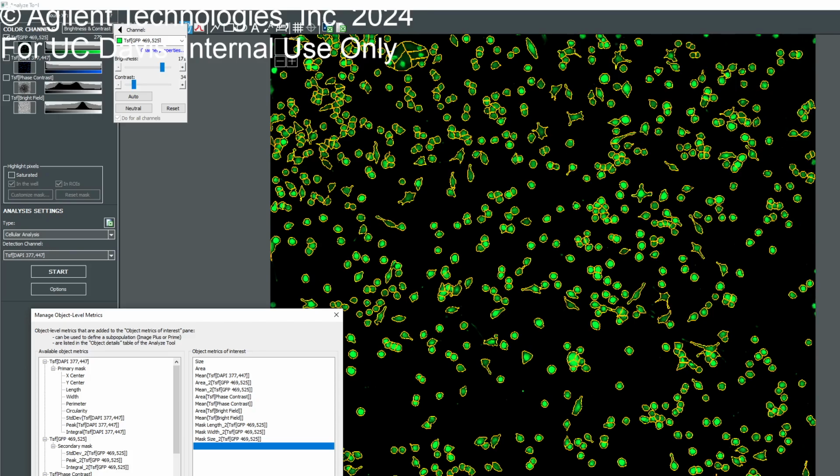Is it correlated to area? If you use length and width and you know the shape of your object, then it should be correlated to the area. I just remember you said it wasn't area when I asked. It's definitely not area. But you get the area here. You have the area here. _2 is that area. Got it. So now we can also remove the things that you don't really need.